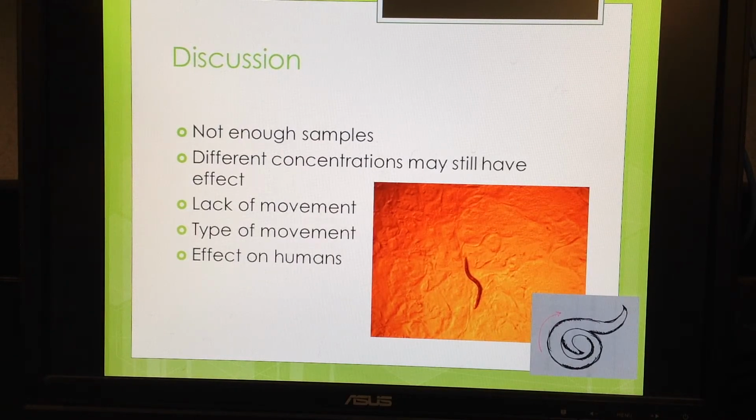This may be due to the different levels of nitrogen and phosphorus concentrations within the fertilizer, with low providing not enough nitrogen and phosphorus to the worms, and high possibly providing an overdose. This would support why the medium had the highest survival probability out of all 3 concentrations. We also noticed irregularities in the movement of our C. elegans. We noticed that by the end of the experiment, the C. elegans had little to no movement, possibly suggesting other health effects.